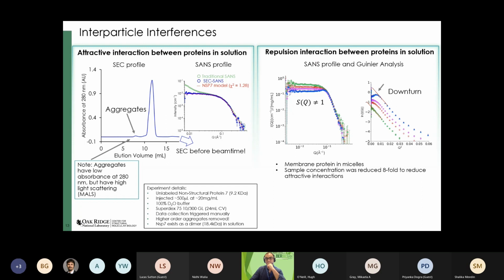What do you think? Yeah, I think the problem is the density, right? You'd have to know the density. I can do a follow up on this question, but I believe definitely the issue is the density. You need to know the density. Definitely, you can recover the volume from the scattering, right? But the density is going to be the issue.